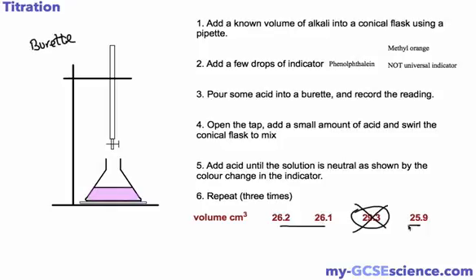Often for our titration we carry out at least 3 times. We can actually keep on going until we get exactly the same reading twice, but that ends up being quite long sometimes. But taking 3 readings, seeing if they're close, gives us a good indication that we have the right or accurate measurement. Okay, so this is the method by which you carry out your titration. If you're lucky, you'll get something like this in a 6-mark question, but certainly something you need to know.